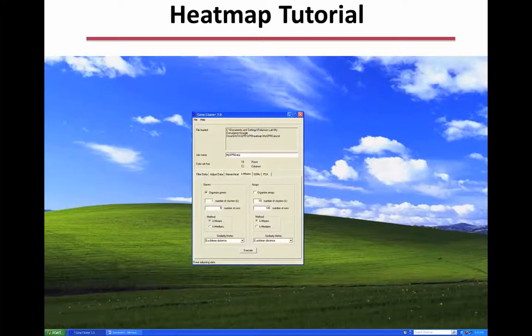The next step is to go to the K-means tab and check the Organize Genes box and put the number of clusters and number of runs as 1. Then simply click Execute, and it will produce a file that's ready to go into the TreeView software.